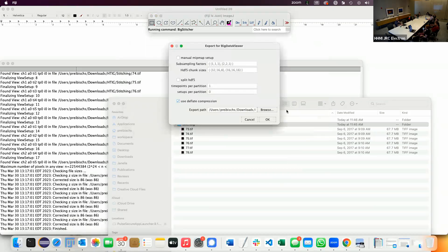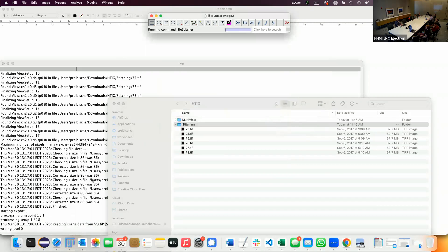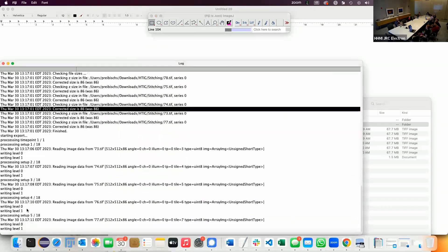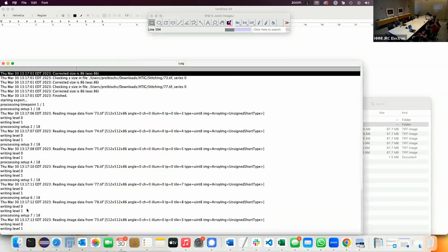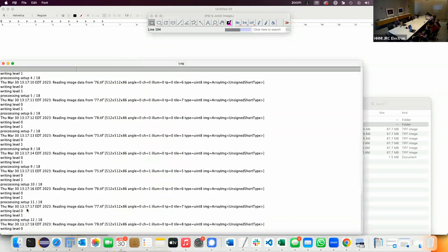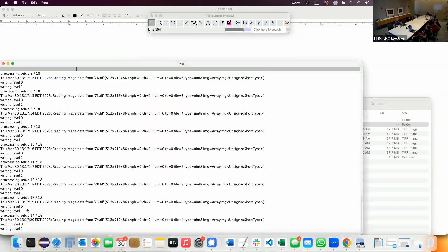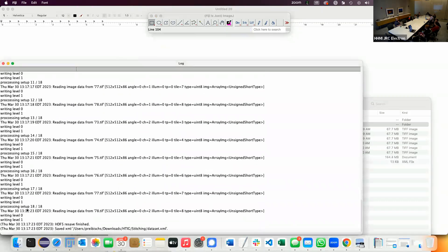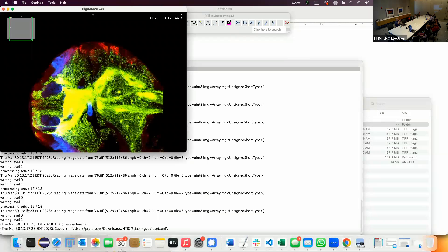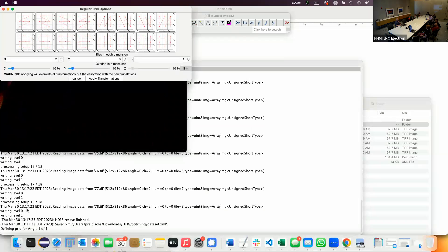Then it does the resaving — reads each file and saves multi-resolution levels. In this case it's only two levels because it's pretty small. Big Data Viewer is smart enough to make educated guesses for how to resave this. It does not work well if the metadata is wrong — for example if it says data is isotropic when it's not. So it's important to set the metadata at least approximately right — even a rough guess of Z resolution is better than no guess.